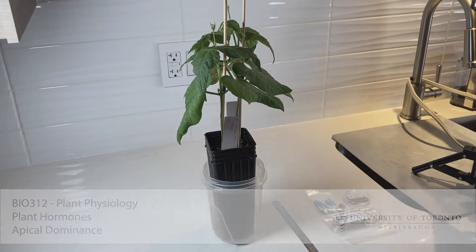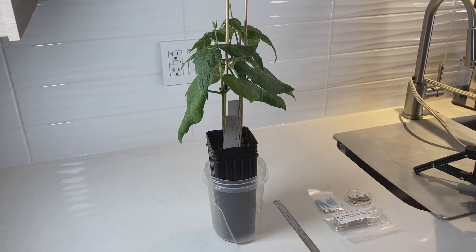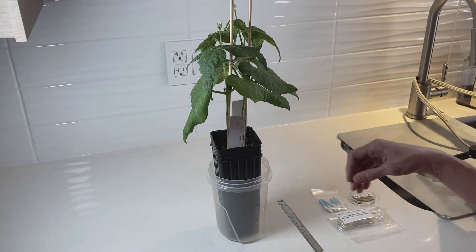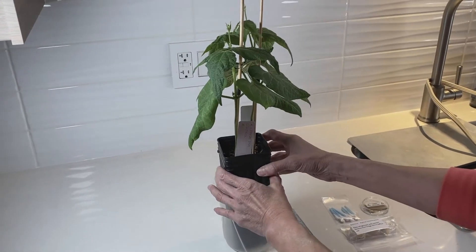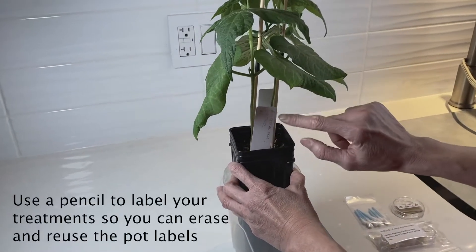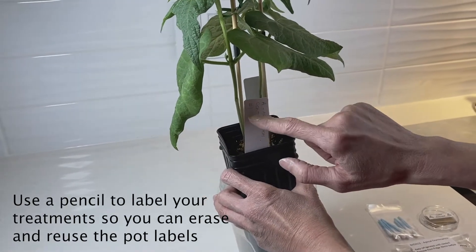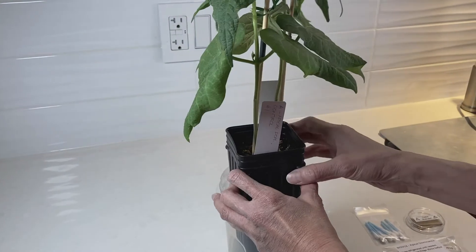Hi everyone. This week we're going to start the apical dominance experiment with the plants you've been growing at home. I've already labeled my plants. This is my control plant pot here, and as you can see I've got it labeled for apical dominance and control, and I've numbered my plants so I can keep track of which one is which.